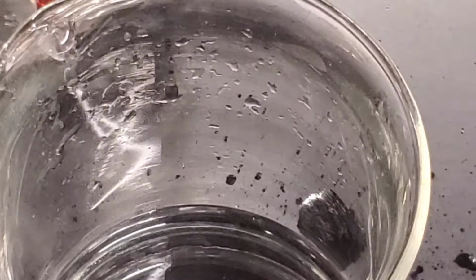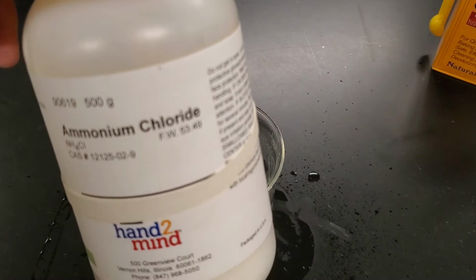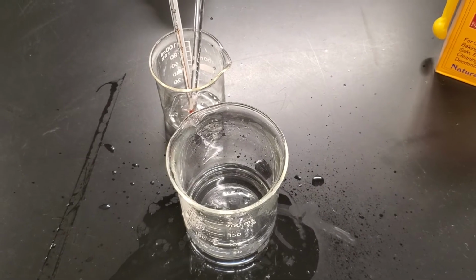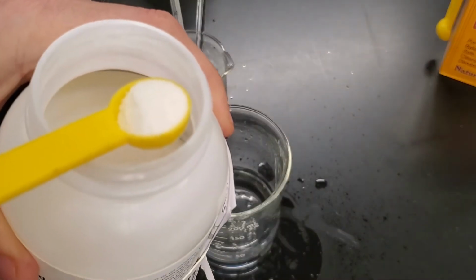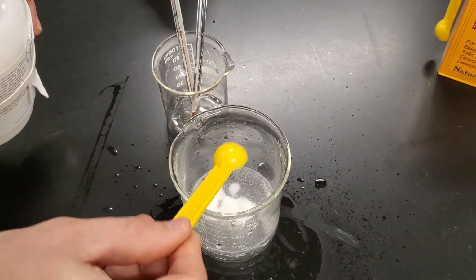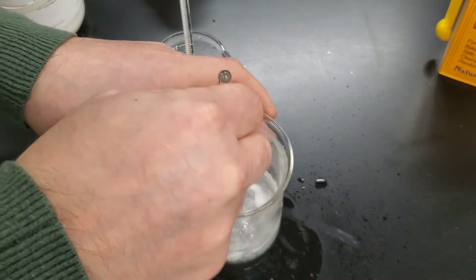Again, we're going to be using 5 grams of, this time, ammonium chloride. Ammonium chloride looks a lot like salt. It is a type of salt, so that's one of the big reasons why. Of course, you wouldn't want to eat it, but the grains are much smaller. So we'll go ahead and add our 5 grams here. We want to make sure we give that a good stir so it dissolves.